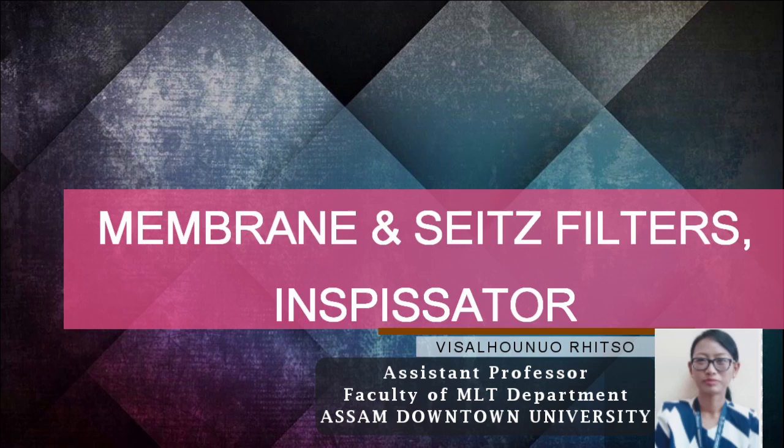Besides porosity, other factors also influence the efficiency of filtration. They are the electric charge of the filter, the electric charge carried by the organisms, or the nature of the liquid being filtered. Filtration of liquids is accomplished either by putting the solution through a cellulose acetate or cellulose nitrate membrane with a vacuum, that is, by applying negative pressure in the filter paper, or by forcing the solution through filter paper by imposing positive pressure above the fluid.